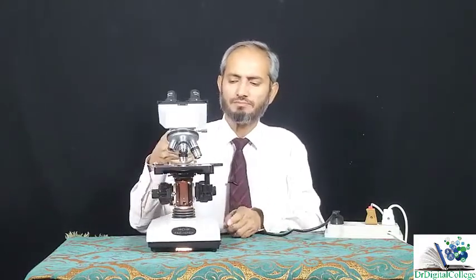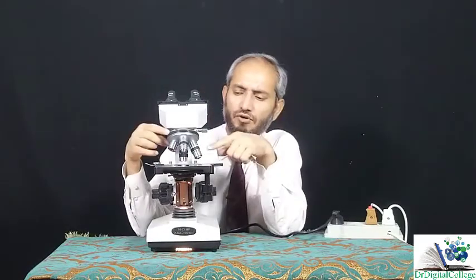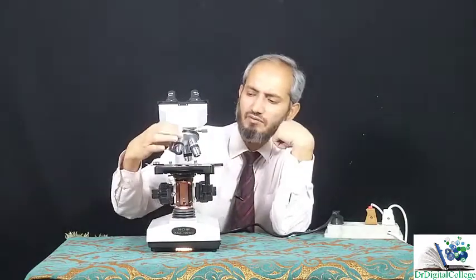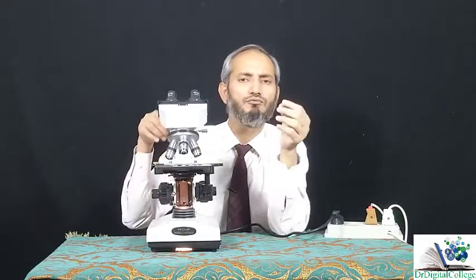Okay, now it is focused. If the object is focused with one objective lens, it is focused for all the objective lenses. Say, for example, I can see with this yellow objective lens. Now if I change the yellow objective lens to the red objective lens of 4x magnification, my object will remain focused. Yes, I can see right now that my object is still focused.